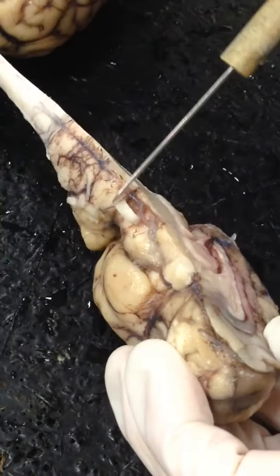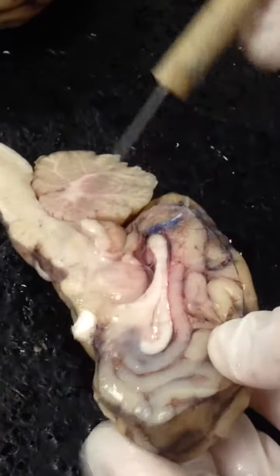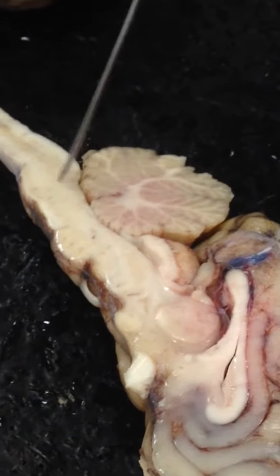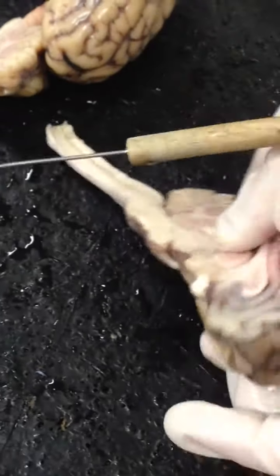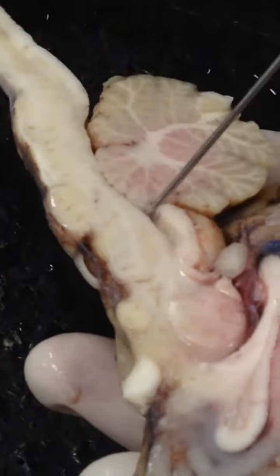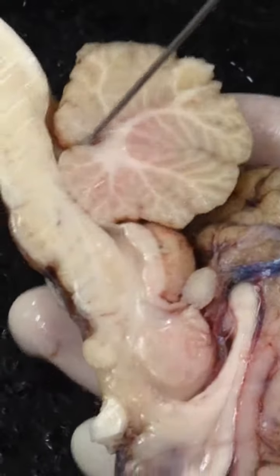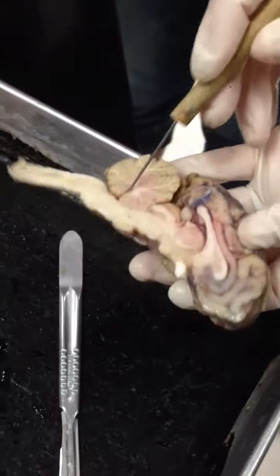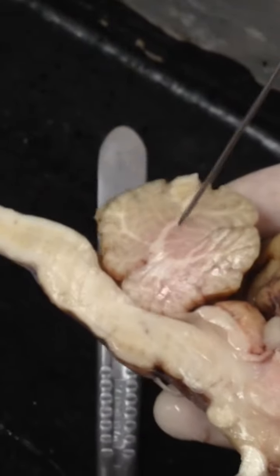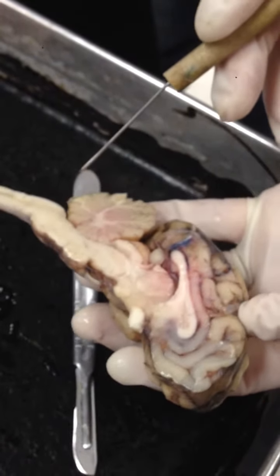You still have your mammillary body, alright, which I would never ask you from a sagittal view, but just so you know it's here, okay? The hump, I could ask you from a sagittal view, that's still the pons, alright? This is still medulla oblongata, and then your spinal cord. You can see the cerebral aqueduct, which is that line that runs down here between the cerebellum and the medulla oblongata. Okay, when you reach here, you can see it goes in. This is the fourth ventricle in here. Okay, the white portion of the cerebellum is called the arbor vitae. And I think those are all the structures.